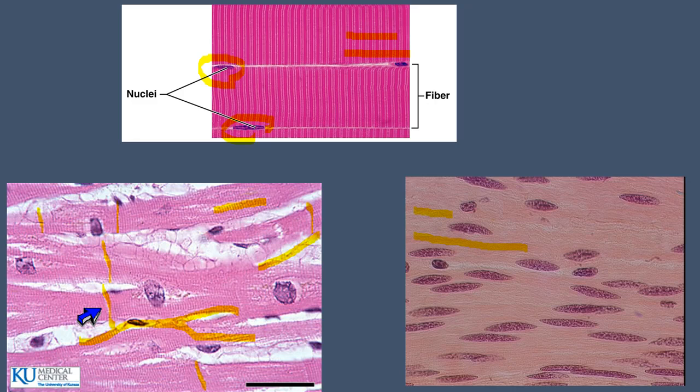So when you look at the cells, number one, a neuron is very unique in its branching shape and the fibers. Muscle itself is also kind of unique in the structure. If it's skeletal or cardiac, it's going to have the striations. Look for the intercalated disc. That tells you it's cardiac. Epithelial tissue always has one free surface on it. And like I said, it's like anything else.